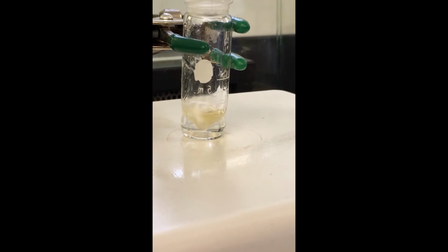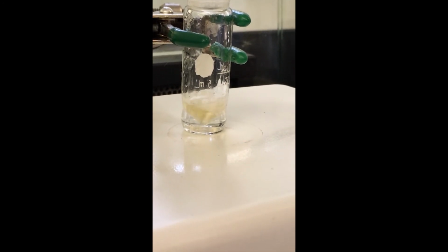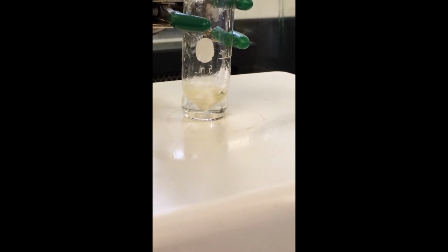Okay, so as you can see, we've now reached the point where the solvent is at a gentle boil. I just turned the heat down a little bit because I don't want it to get any hotter than this. We just want the solvent to stay at a gentle boil. The reason is because having the solvent too hot can actually cause decomposition of our product and will result in contamination of our final product.